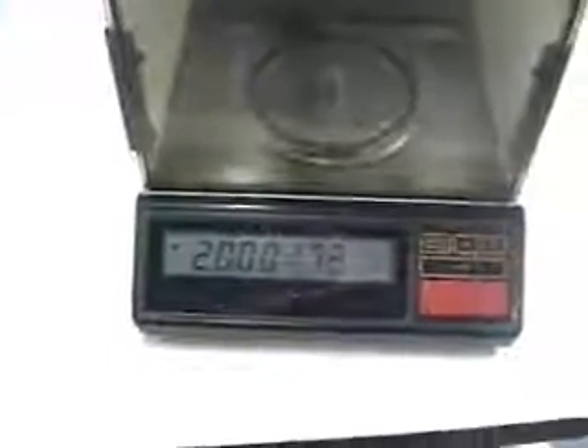We'll just put a 20-gram weight on it. Reads and zeros in. This is not on a marble balance table, so there's got to be a little fluctuation in the numbers.